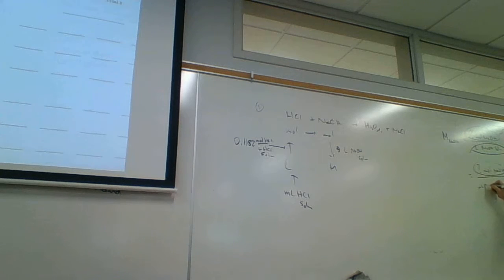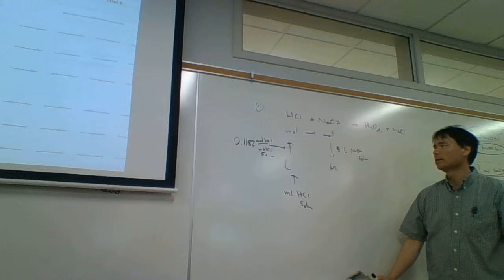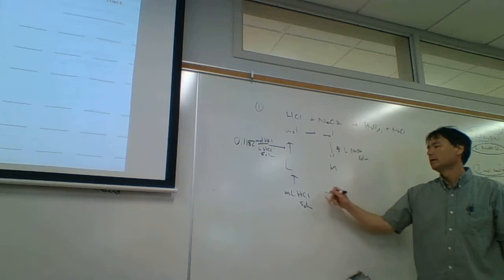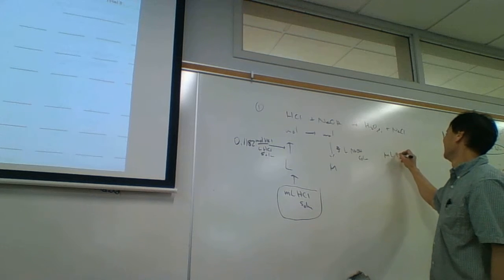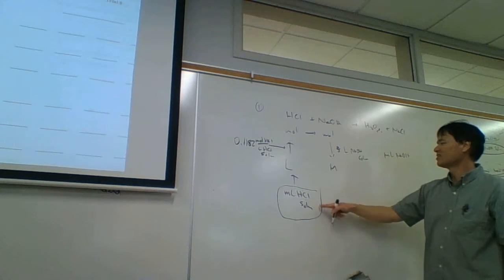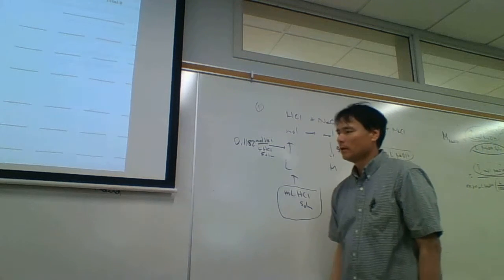So we're going to get the milliliters of sodium hydroxide that we used in trial 1. However many milliliters that is, it should be x.xx milliliters, and then just convert it to liters. A liter is equivalent to 1,000 milliliters. And so that's what we'll do here. So that's this final step in determining the molarity. And so we have all the numbers here. We have the milliliters of HCl and the milliliters of sodium hydroxide, which is going to take us here.